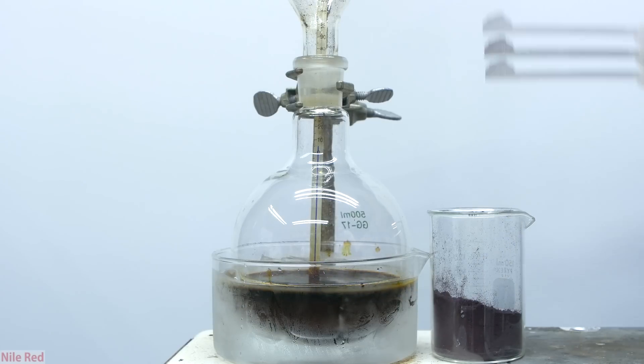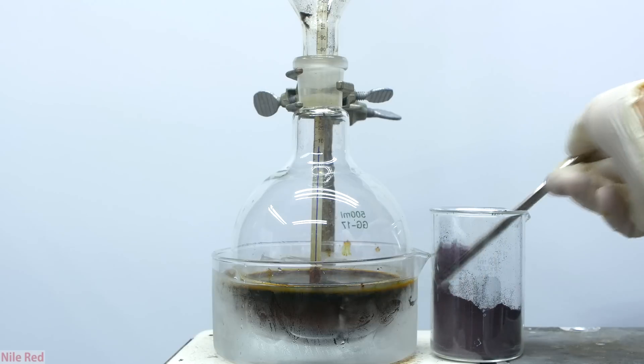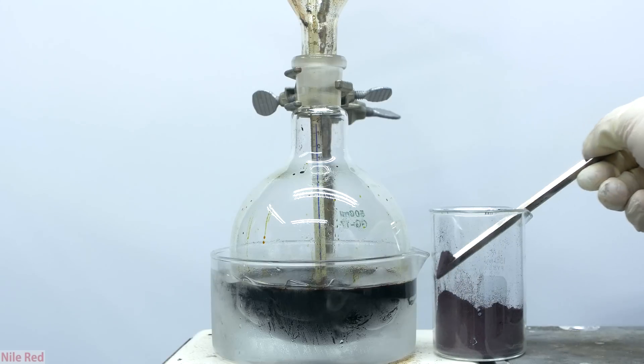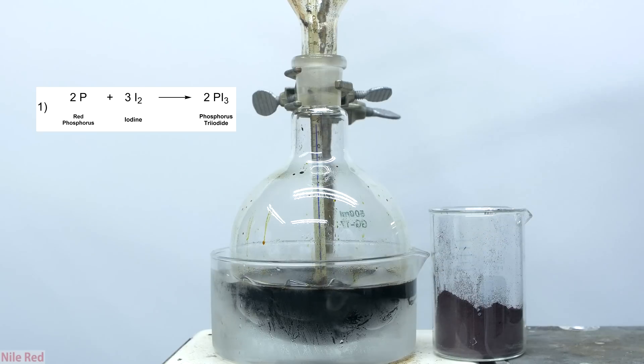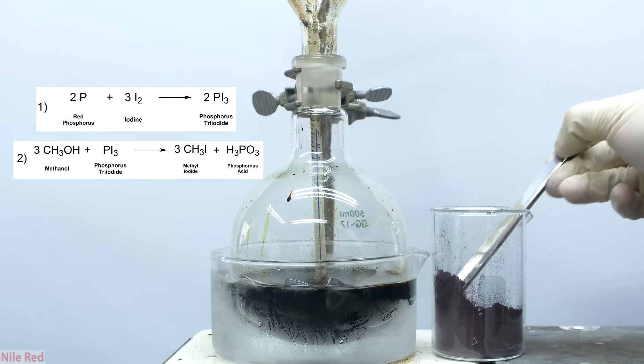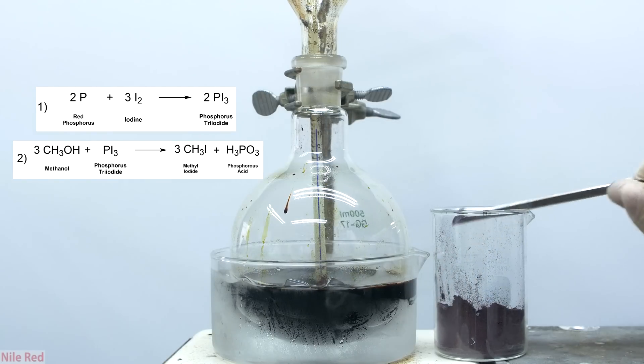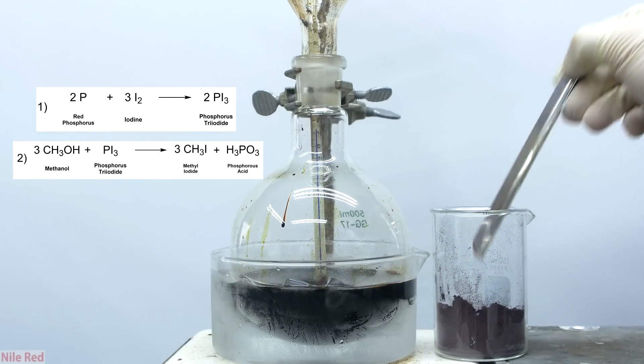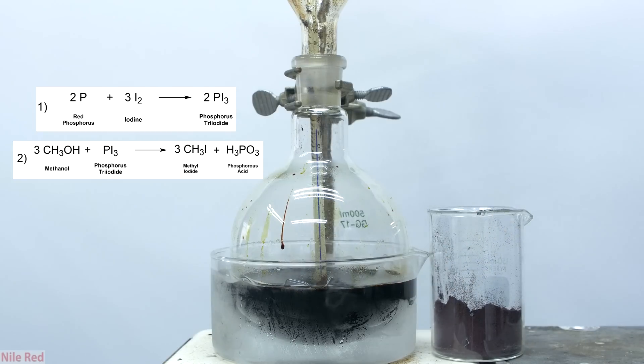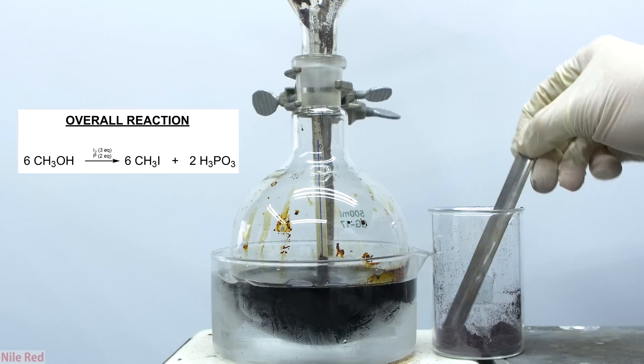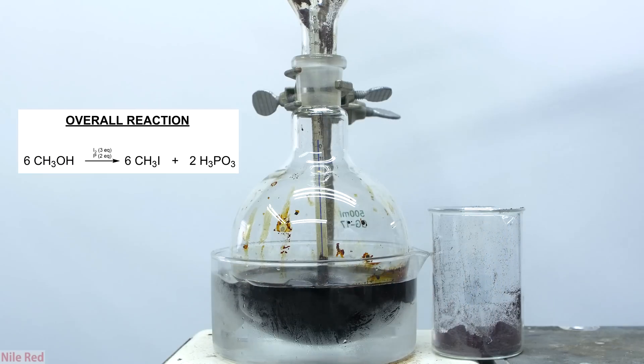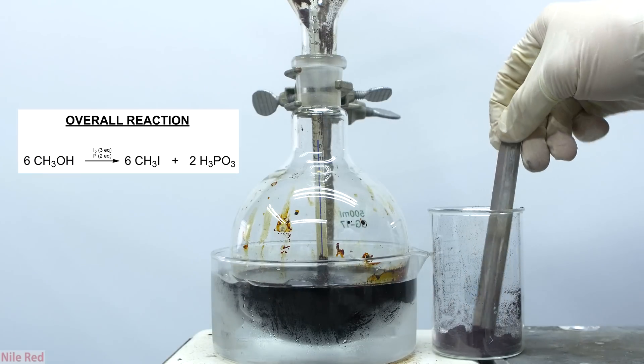While we're adding all the red phosphorus, I think it's a good time to talk about the reaction that's taking place. When the red phosphorus is added to the mixture, the first reaction to take place is between the phosphorus and the iodine to form phosphorus triiodide. The phosphorus triiodide is extremely reactive and immediately reacts with the methanol to produce our methyl iodide as well as phosphorus acid as a side product. Both of these reactions can be pretty easily simplified into one chemical equation, and I've included that here as well.